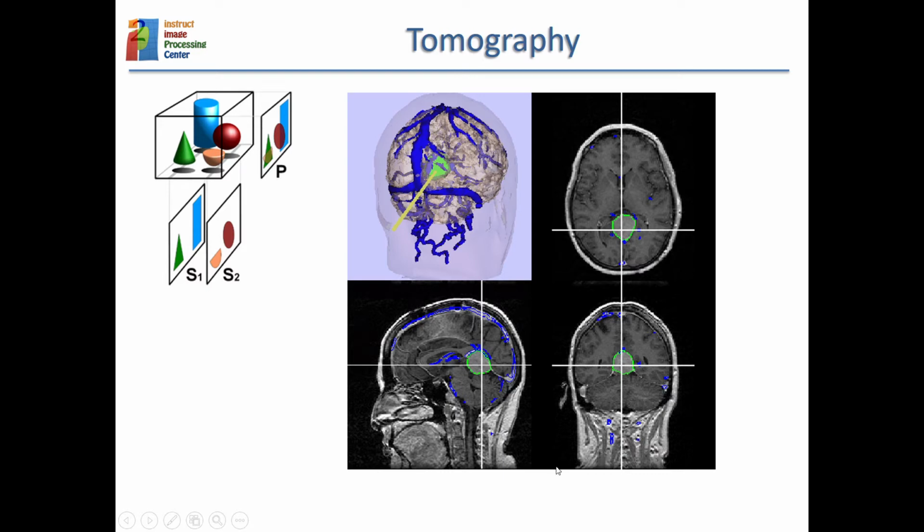So this is what we do when, for instance, we have this 3D object and a 3D surface representation of it, and then we make slices through different axes to have this top view, this side view, and this view from the back.